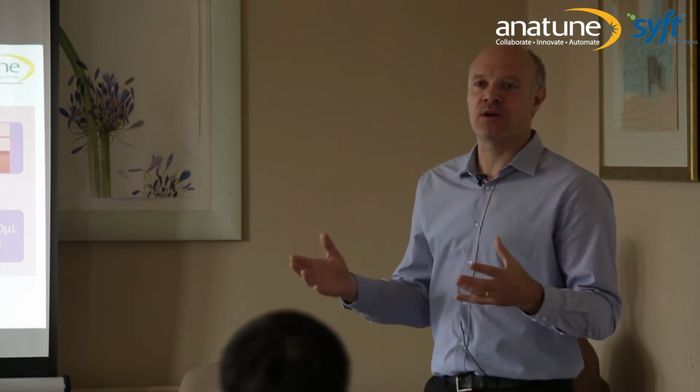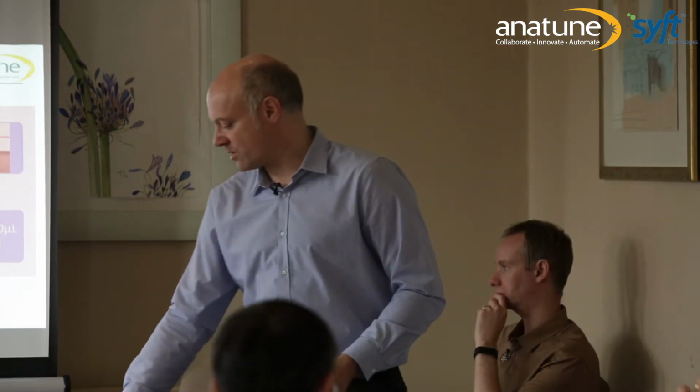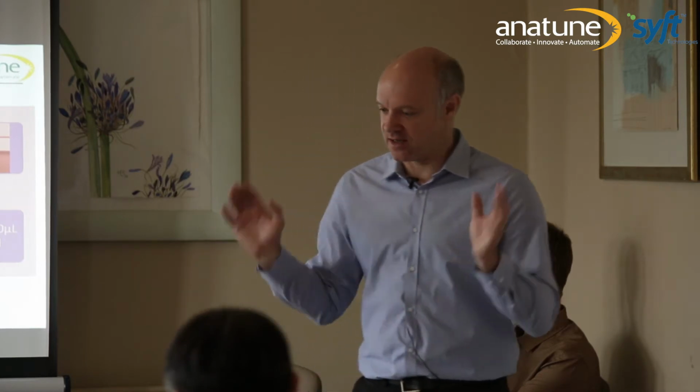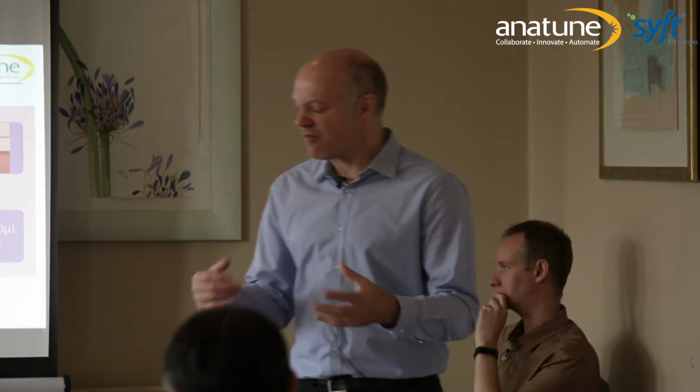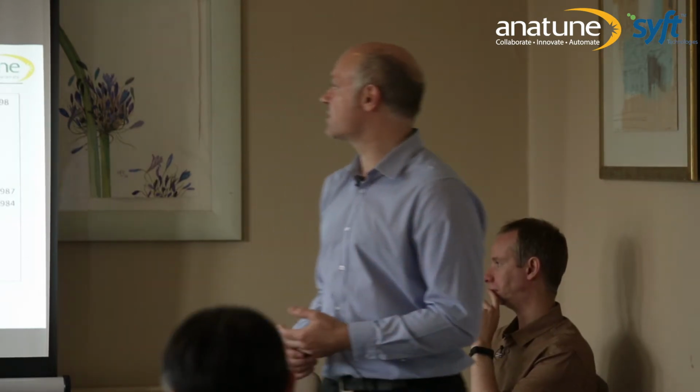So it's an example of doing complicated method preps and running it through the SIFT-MS. What we wanted to do was just say, if we had some soil, does this method stack up, or do we get completely random results? So I followed the sort of ICH type approach. First things, of course, is to look at linearity.